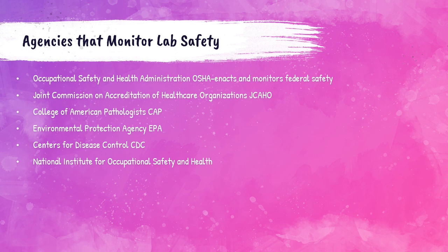OSHA also monitors the Bloodborne Pathogen Standard, enacted in 1991, which prescribes safeguards to protect workers against health hazards related to bloodborne pathogens or other potentially infectious materials. The Personal Protective Equipment standard ensures employers provide adequate protective equipment — including PPE for eyes, face, head, and extremities — and keep this equipment maintained in a sanitary and reliable condition.